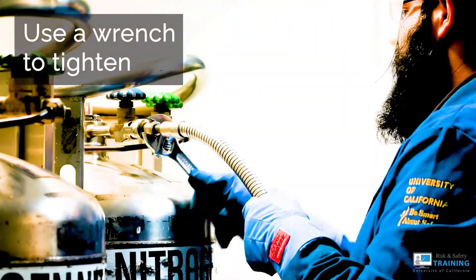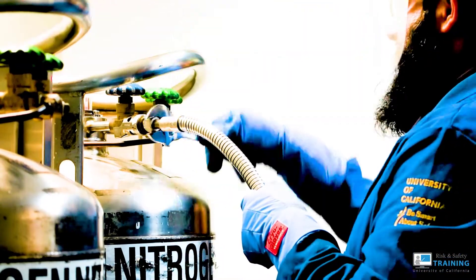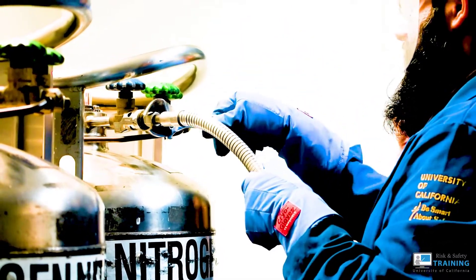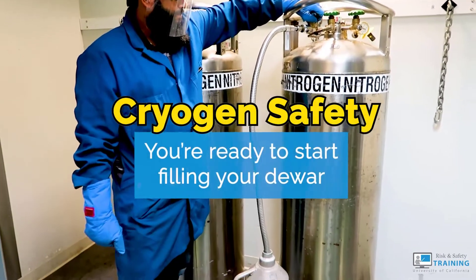Grab a wrench and begin to tighten. Turn the wrench gently until the transfer hose is attached securely. Now you're ready to start filling your dewar.